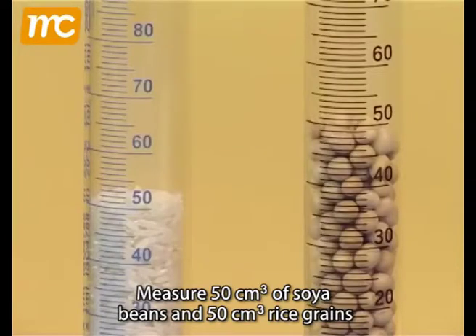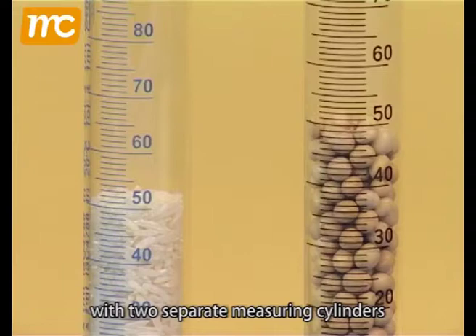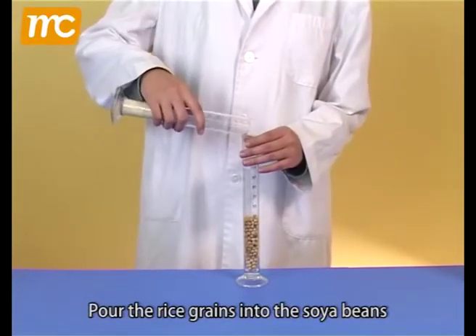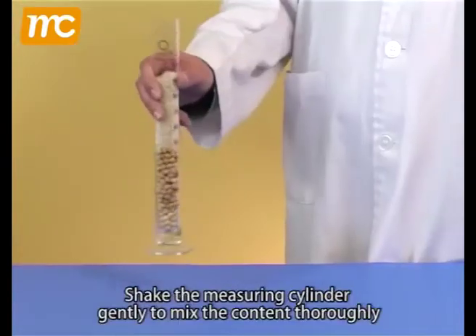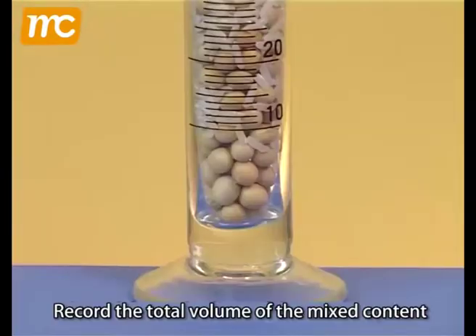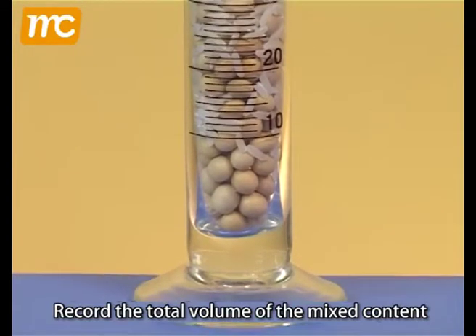Measure 50 cubic centimeters of soybeans and 50 cubic centimeters of rice grains with two separate measuring cylinders. Pour the rice grains into the soybeans. Shake the measuring cylinder gently to mix the content thoroughly. Record the total volume of the mixed content.